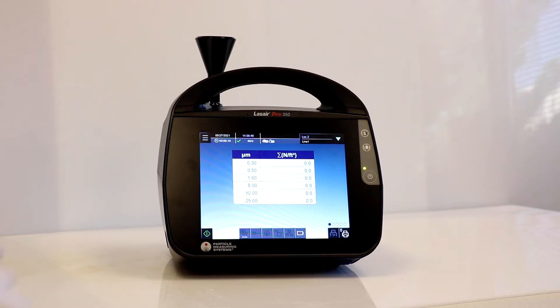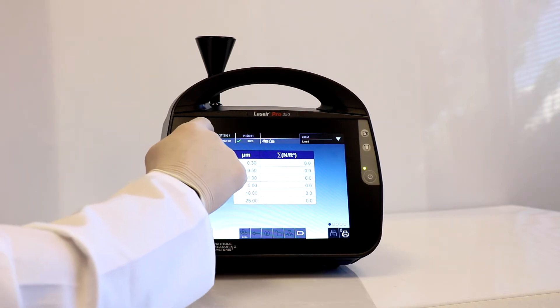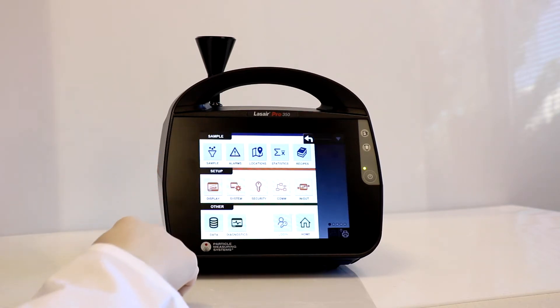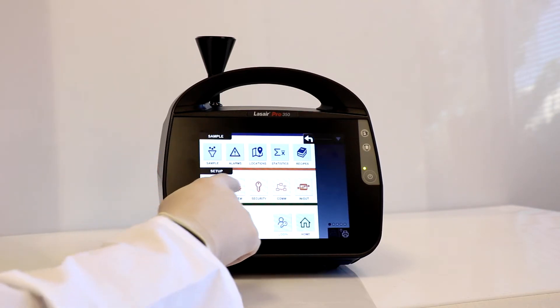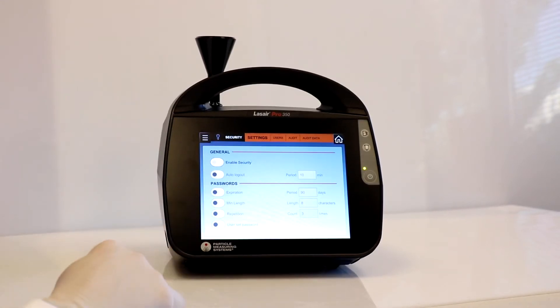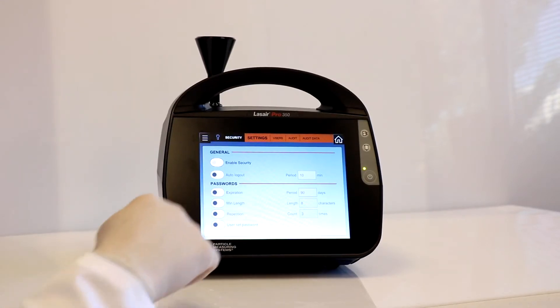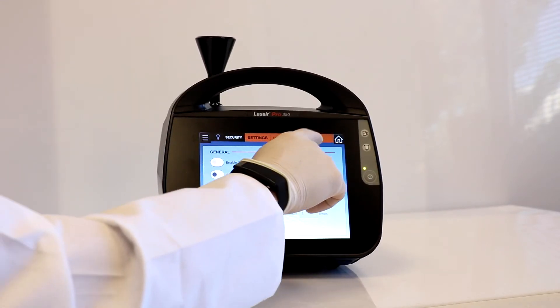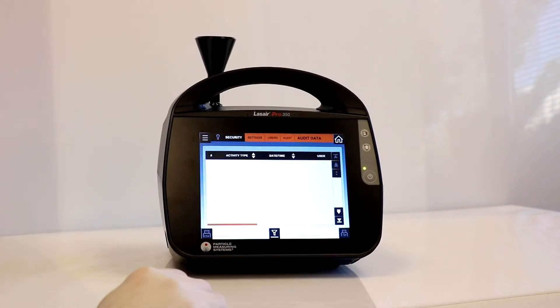To start, navigate to the menu screen and then select the security icon. Once done, we select the audit data and notice there is no data in the audit table.